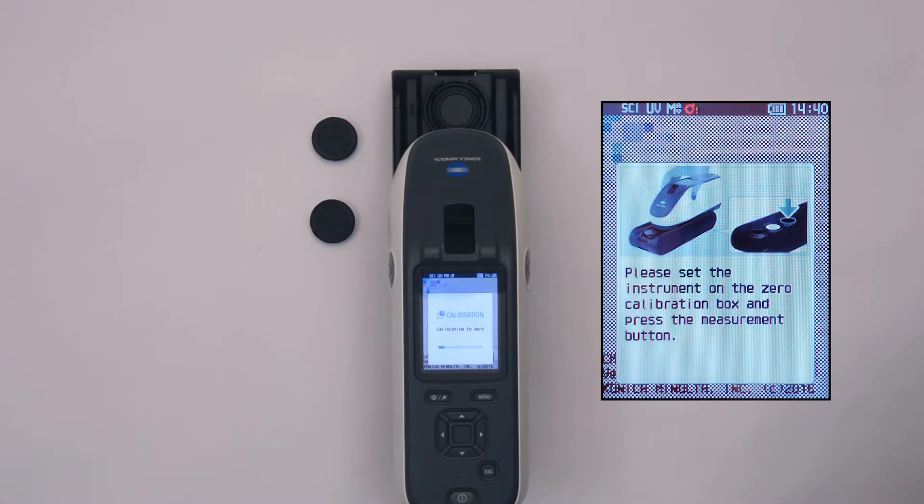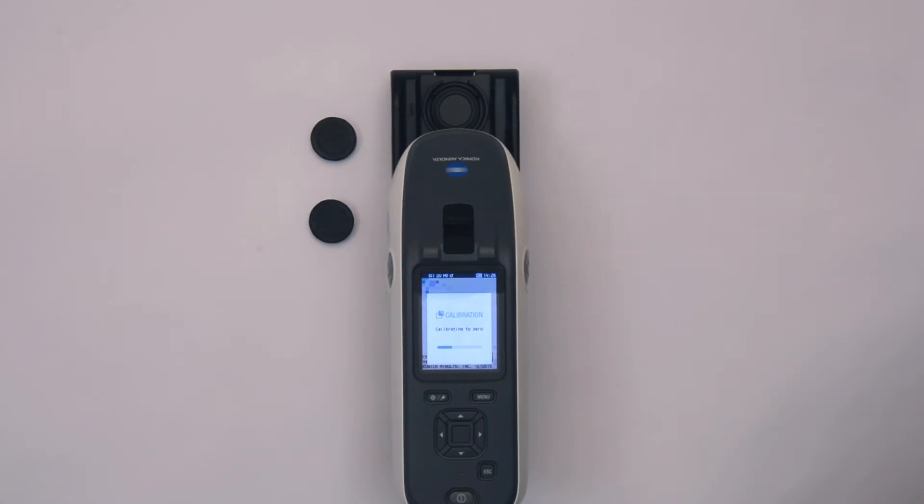To begin, remove the protective caps from the white and gloss calibration standards, then proceed with the calibration. The instrument will prompt you through the calibration process for white, black, and gloss.